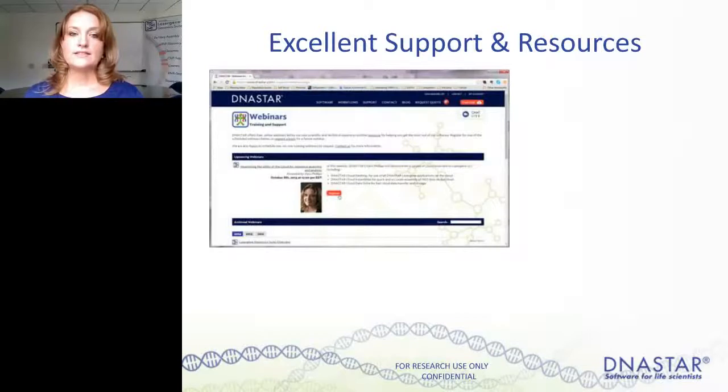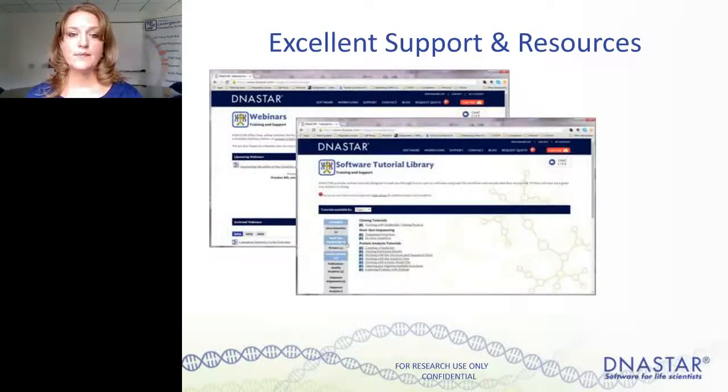Another advantage of DNASTAR software is the wealth of resources that are available to our customers. So right on our website, you'll see that we have 3 years of pre-recorded webinars on there on a variety of topics. We also have a complete library of software tutorials, and you can search for them by product name or by topic.